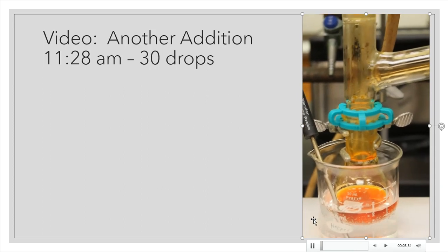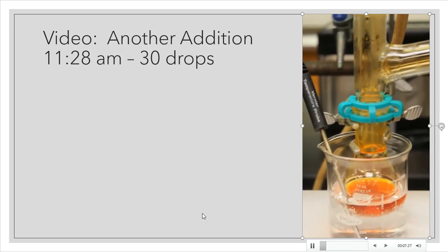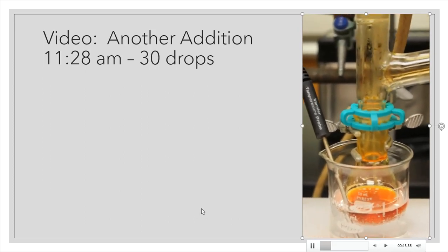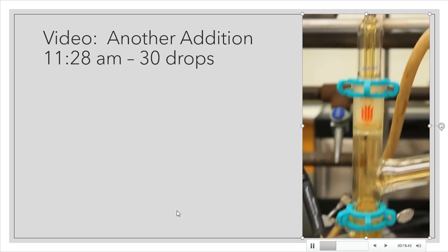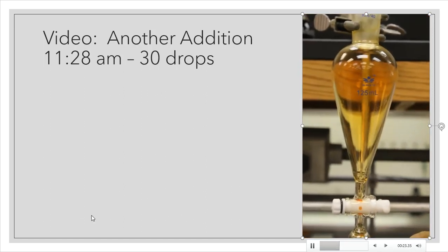So we're at our last addition. I've just added it. Notice that the beaker, or the boiling flask, right now is very deep orange again, and it should be. I just added the last portion. Over time, we hope that this will continue to lighten, because I'm going to have to sit and wait for 15 minutes. Just to prove that I've added all of my separatory funnel addition, there we go.